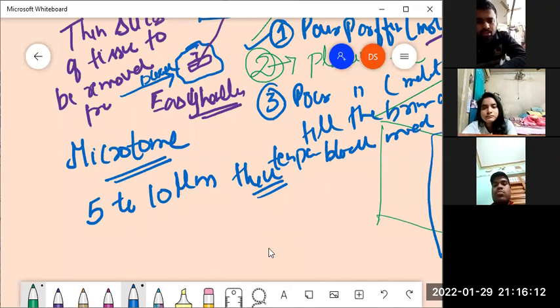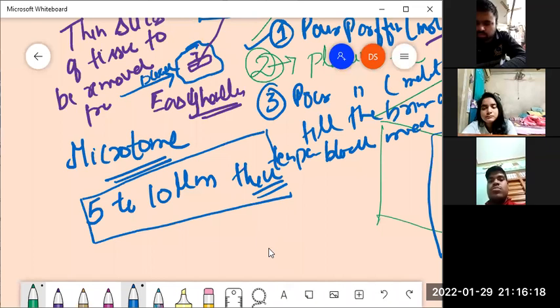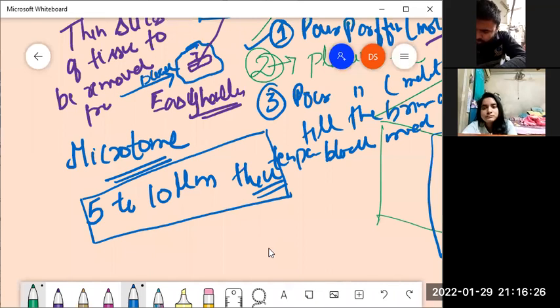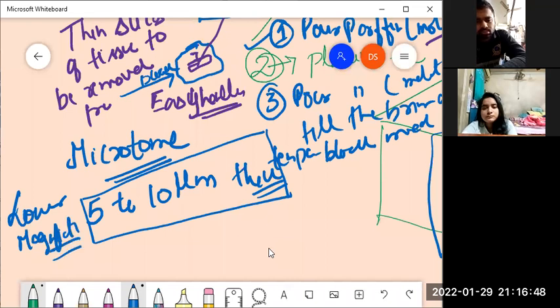Now, this thickness is sufficient for a light microscope. If the slices are even thinner than 5 micron, then the chances again would be that gross details would get lost. See, with light microscopy, we start with the lower magnifications first to observe the gross details.